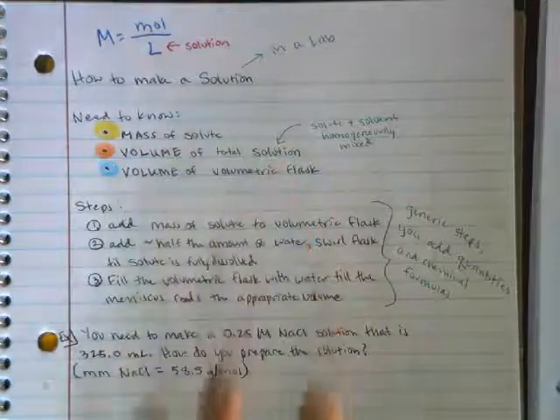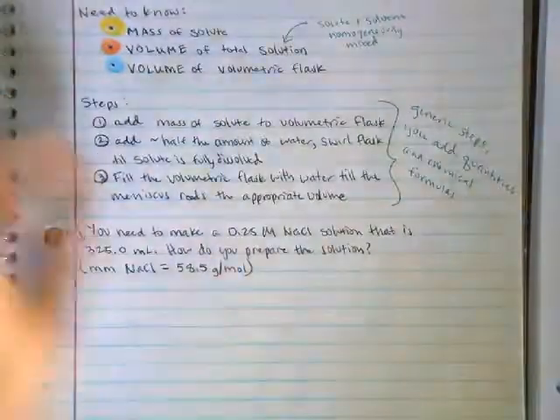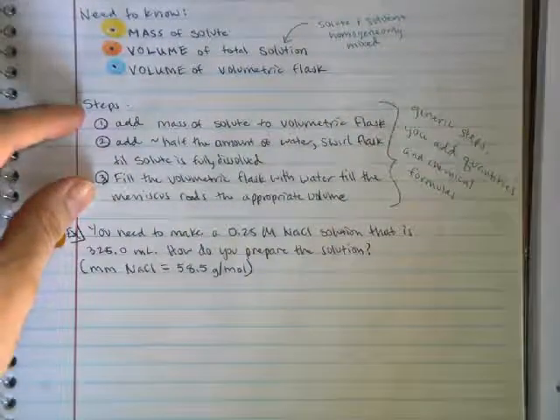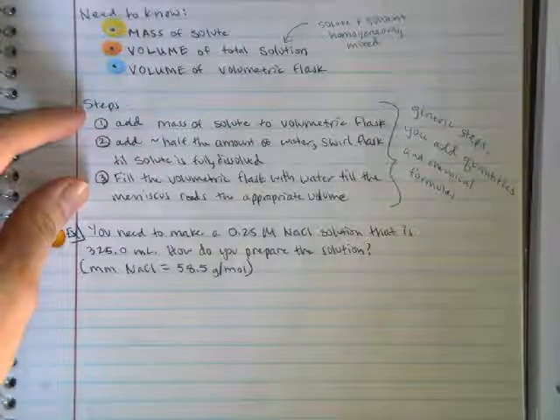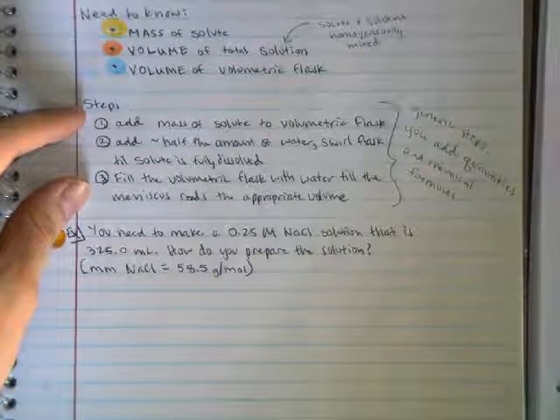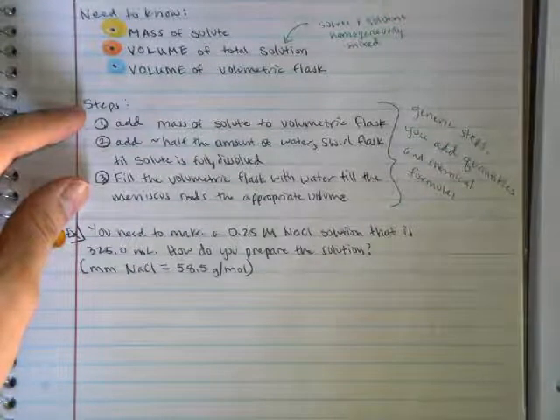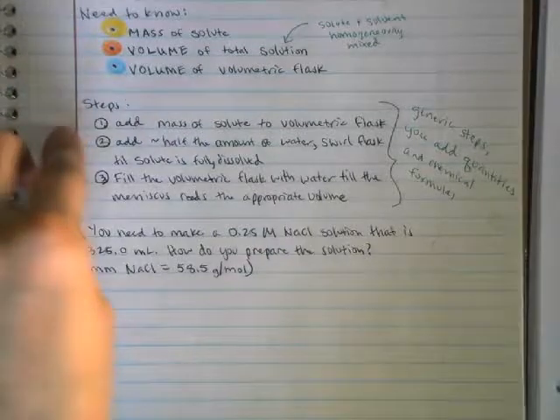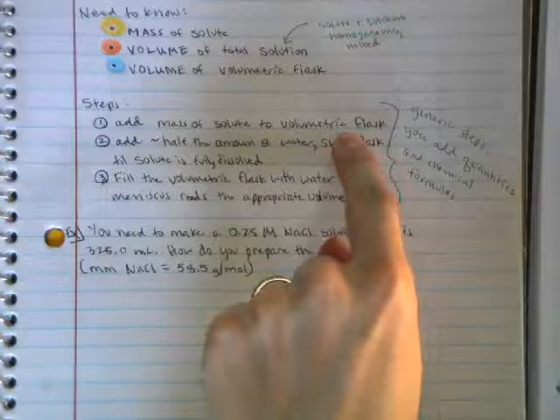So the steps for actually making the solution are very simple. You just need to follow them exactly. These are them in very generic terms. When you write out these steps for yourself for a specific solution, you will add in specific information like quantities and chemical formulas, etc. So the steps. First, you need to obtain an appropriately sized volumetric flask.